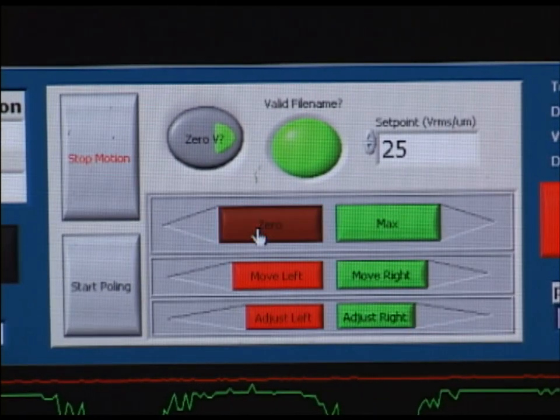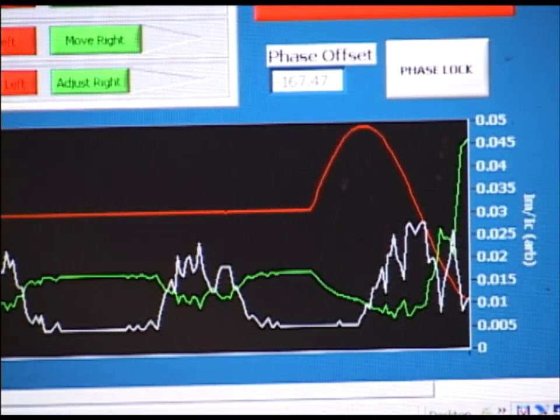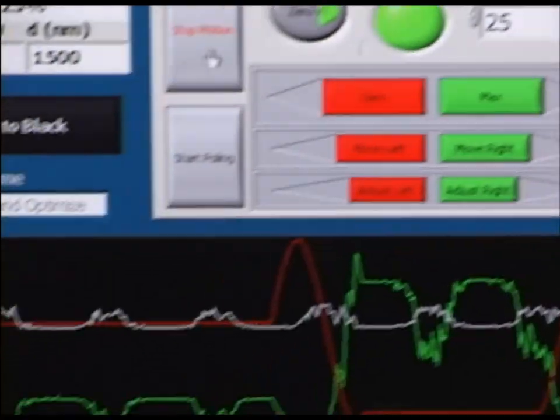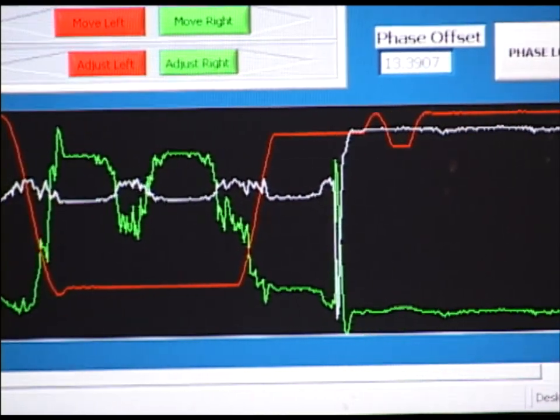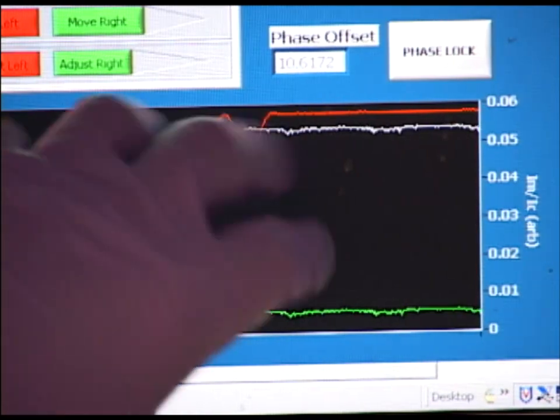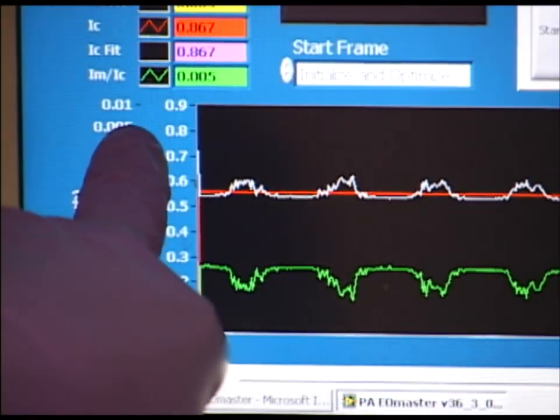First I will click the zero button to begin moving the compensator. We can see the signal into the photodiode changing now as the compensator is rotated. We want to adjust the compensator to achieve the maximum I sub M value, which is shown as this white trace here. I have adjusted the compensator, shown by the red trace here, until I've achieved the highest I sub M value. It's important to keep in mind that we do not want the compensator value, labeled by this red trace and labeled as I sub C, to pass greater than one volt.